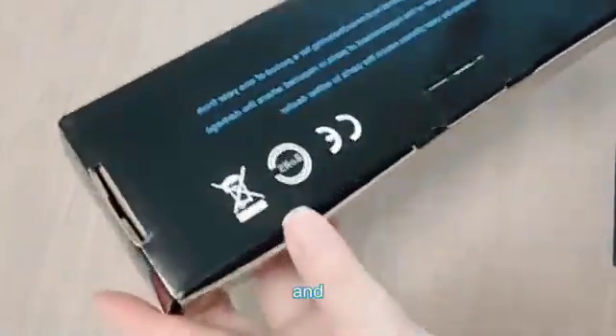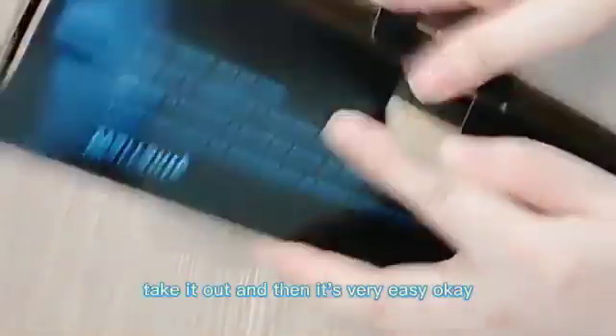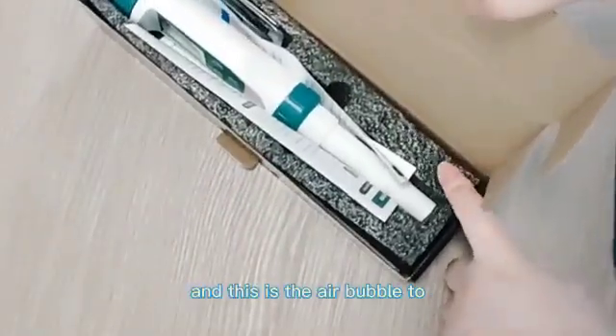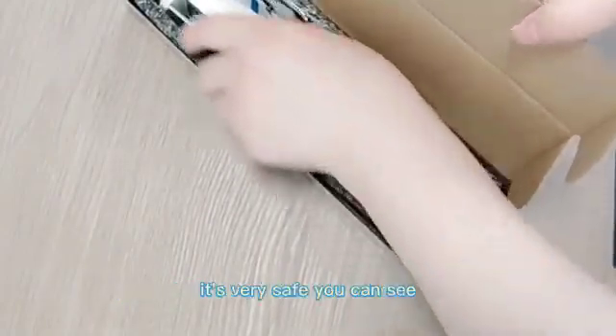Open it and you can see there is a buckle here. Take it out — it's very easy. This is the air bubble padding to prevent it being damaged during shipping. It's very safe, as you can see.